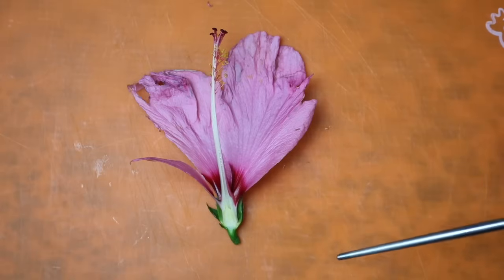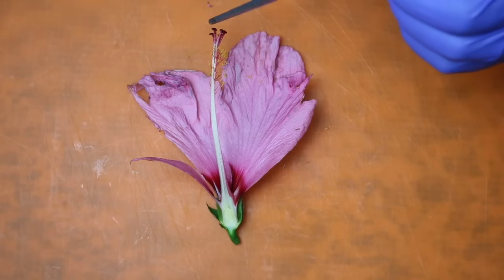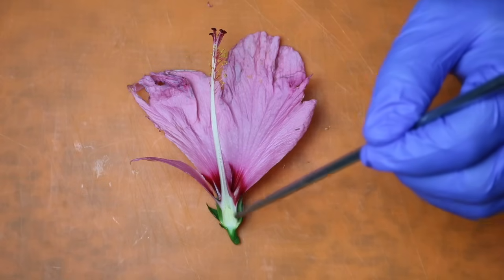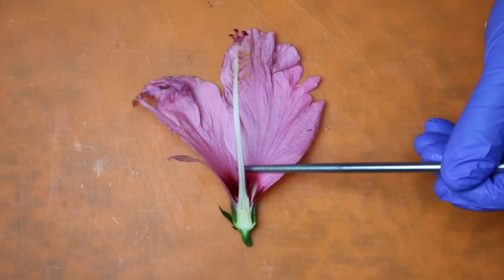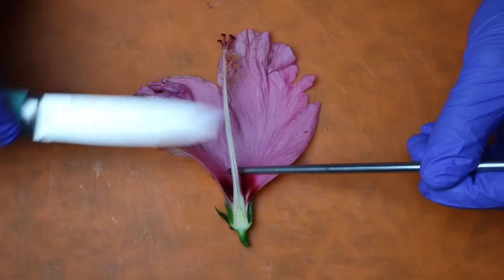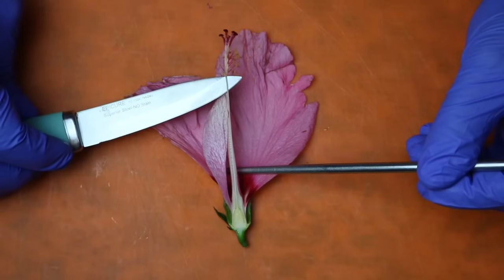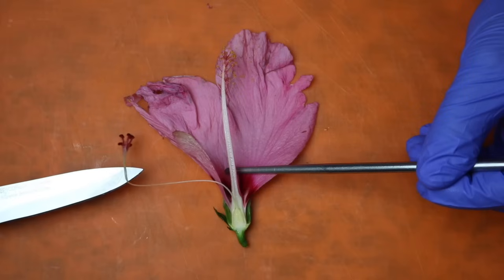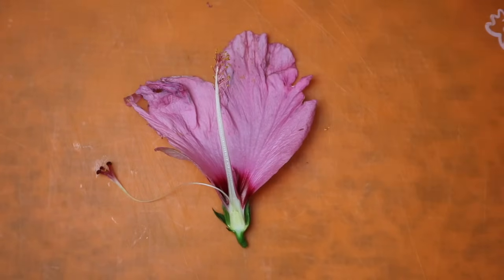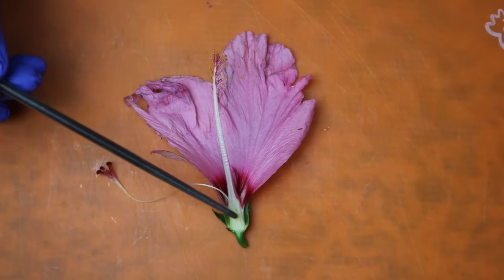Our next step is removing this entire organ — the stigma up at the top, and attached to it is the style, which connects it to the ovary down here. We're going to go ahead and remove that style. A really easy way is just using the back of the knife, facing it towards the top of the flower and sliding it right in between here. You can see just how easily that comes out without damaging it. You can also use a toothpick for that step. We have the stigma here, connected to the style, which travels down and connects it to the ovary.